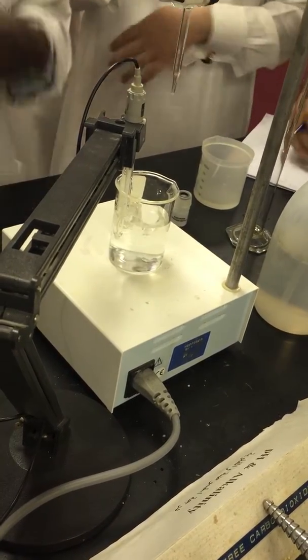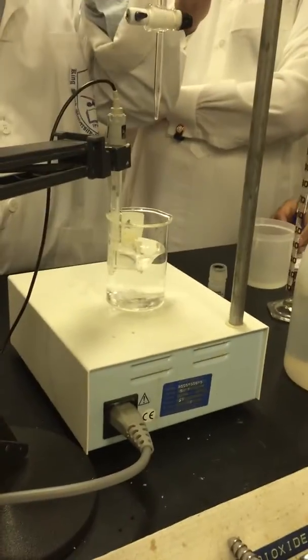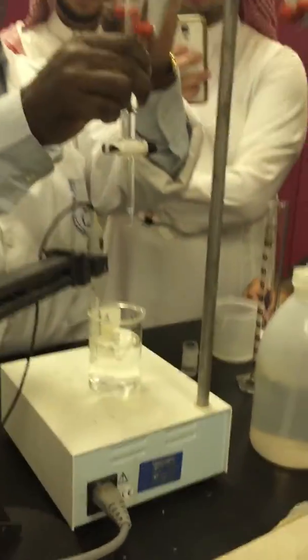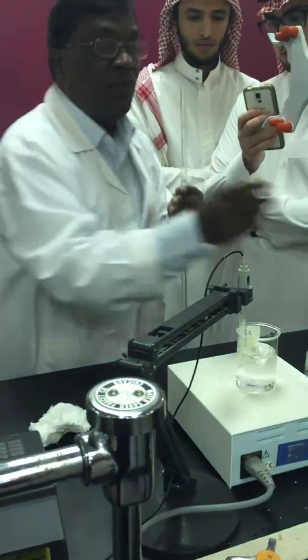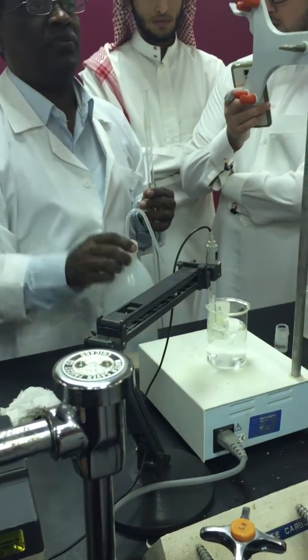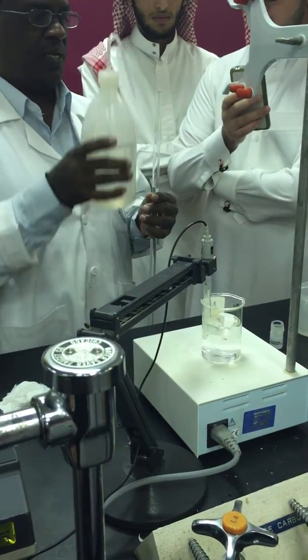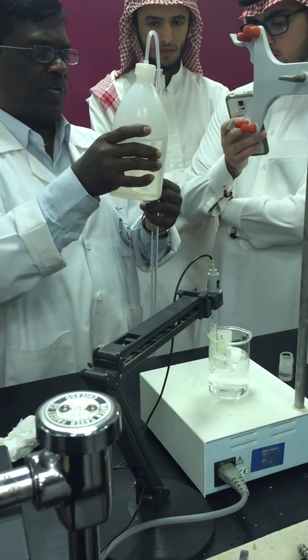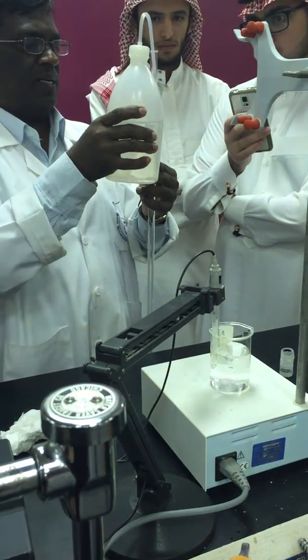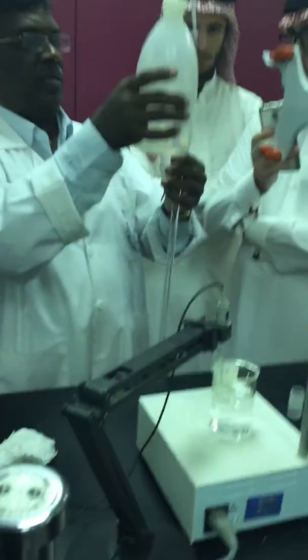Okay, you mix it. Now you can start the acid anywhere. It need not be zero, but it is always better if you start from zero, because sometimes it takes more and sometimes you forget what the initial reading was. I will be given the formula.